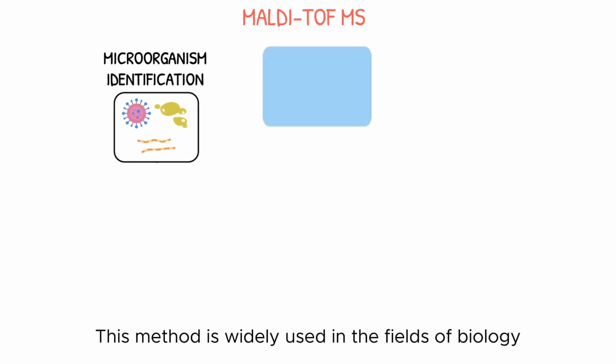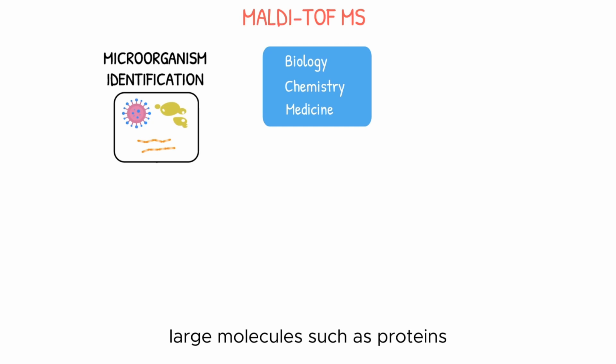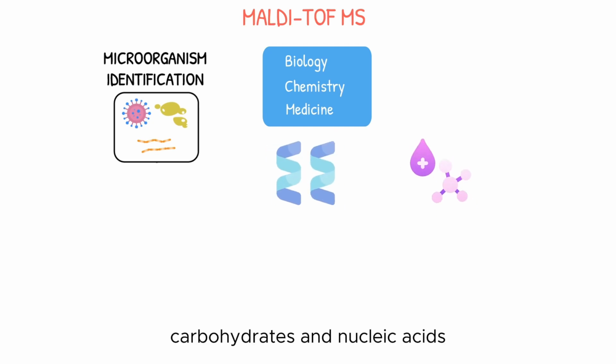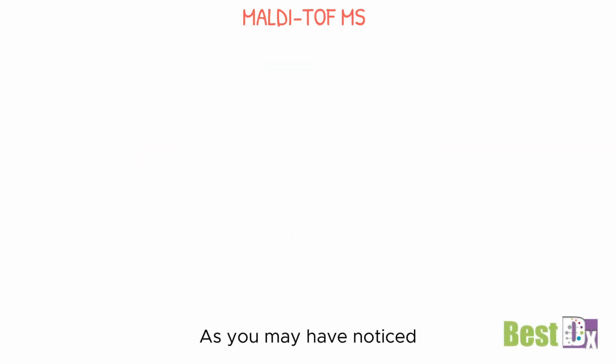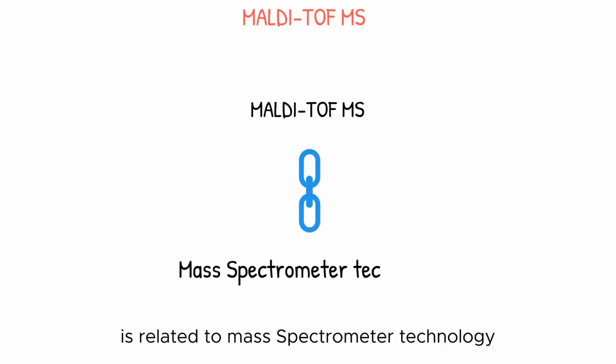This method is widely used in the fields of biology, chemistry, and medicine, and can be used to analyze and identify large molecules such as proteins, peptides, carbohydrates, and nucleic acids. As you may have noticed, MALDI-TOF MS is related to mass spectrometer technology.